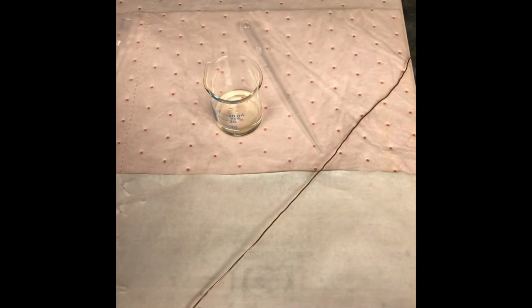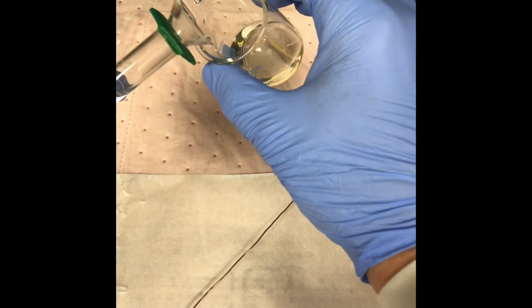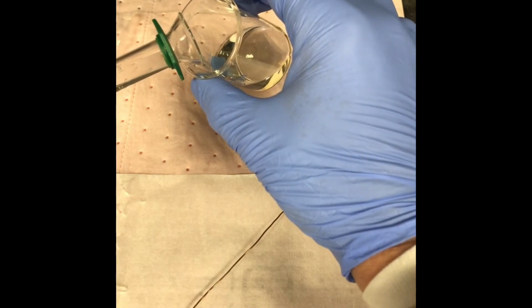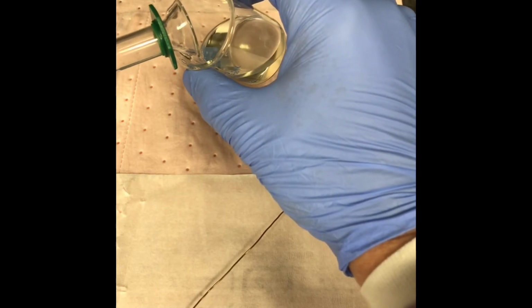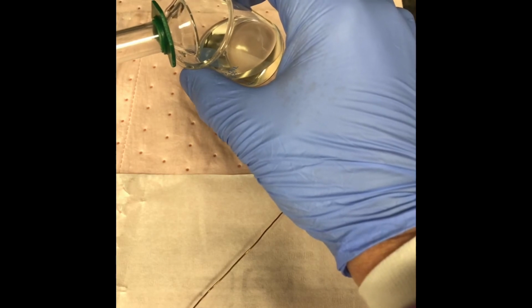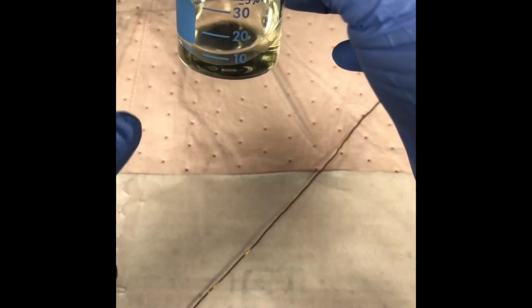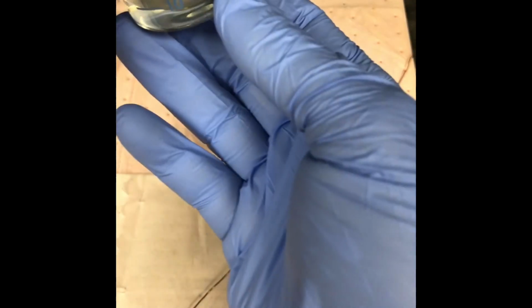And then I will carefully pour down the sides of this reaction vessel the adipoyl chloride, and we should begin to see right away the formation of the nylon strands. I don't want to mix this up too much. I want to just pour this carefully in here. And again, I have it in the fume hood because it's quite odoriferous, and I really don't want to be smelling these reagents. Okay, so hopefully you can see there's two layers, a bottom layer and a top layer, and slowly the nylon will start to form between the two if everything goes well. And when it starts to form, then I'll pull it out with these strands.